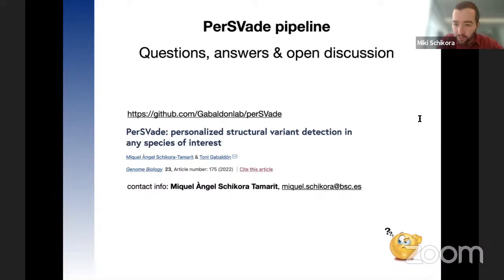And the second one, how it performs with draft reference genomes. I understand this as: if you have a very fragmented assembly, how will it work? It will work, but many of the variants will not be real. I showed how, if you have a strain that is very different to the reference genome that you're analyzing, you get a translocation and then a deletion. I guess you would have the same problem, so the whole downstream analysis would be a bit problematic. Technically it will work, but the interpretation of the variants would be a bit harder.